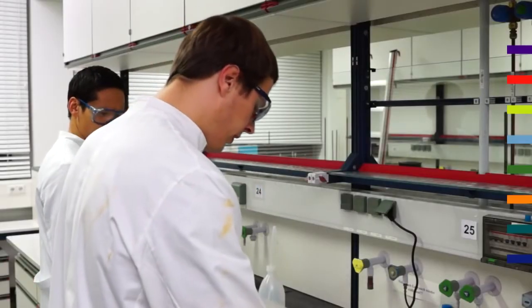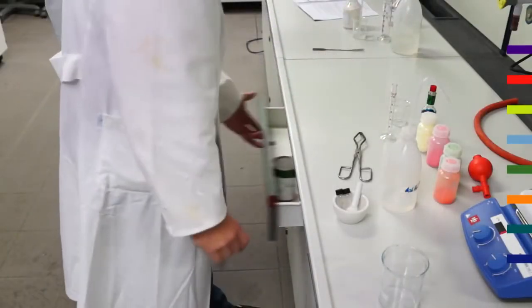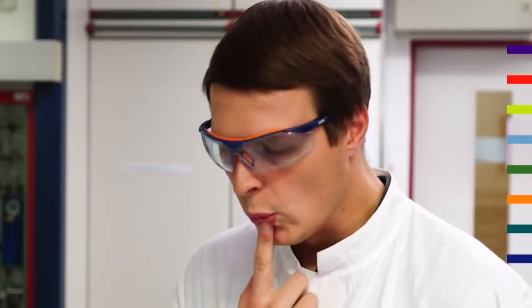Well, this soup has to ferment now for an hour. I guess it's going to be okay over here as well. The fume hood is full anyway. This tin is not really ideal. And also the label is missing. It'll be fine. Oh.